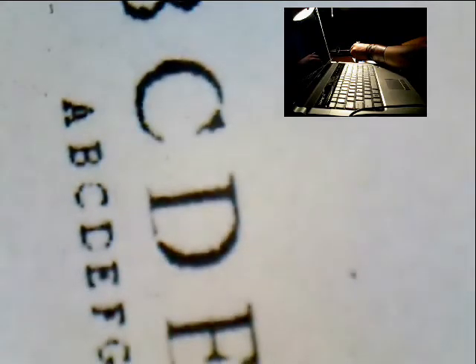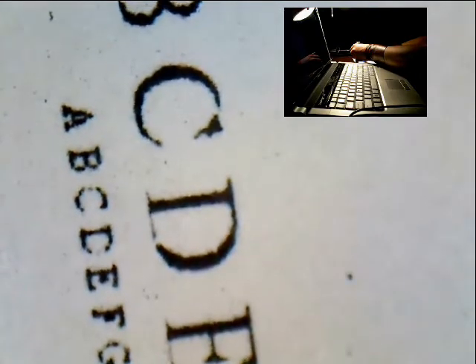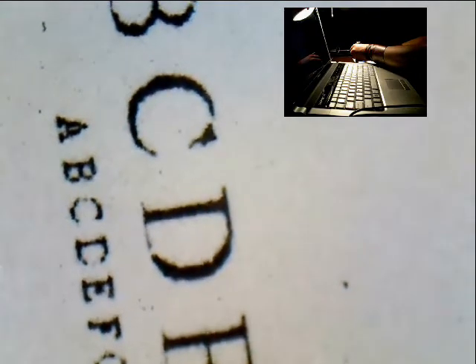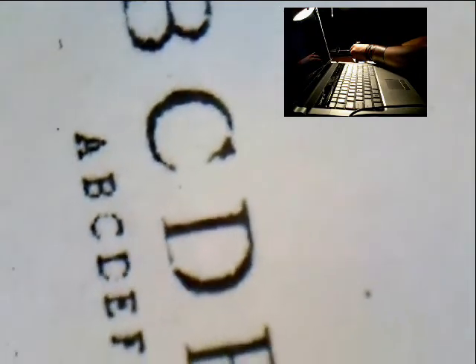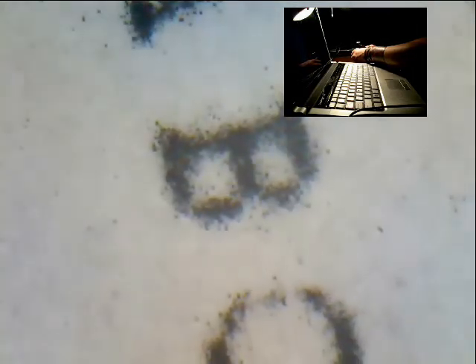You can see it's just the first few letters of the alphabet, and there's the really tiny script kind of in the middle there. A, B, C, D. You can see all the way up to G there, and that's the really tiny one. Now I'm going to zoom in to high, and I'm going to need to turn up the light a little bit. And especially this close, you can see what appears to be fine lines, particularly in the bigger font, is actually little dots here and there. So that one I thought was really neat.